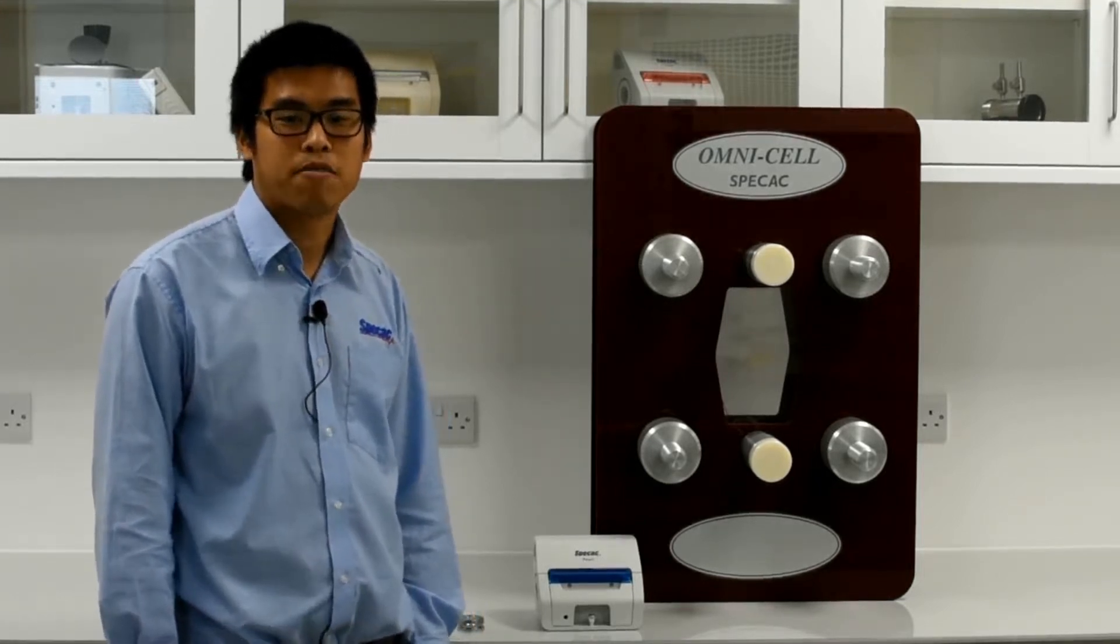Hello everybody, my name is Edmund Lowe. I'm the product manager of FTIR accessories here at SPECAC, so essentially anything that goes inside a spectrometer I look after.